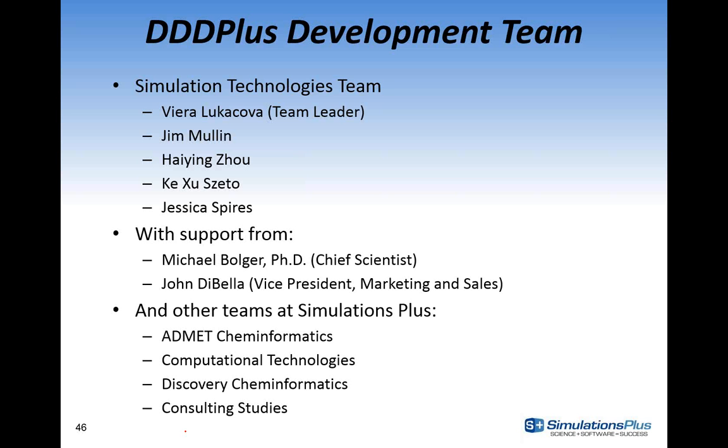Related to some additional feedback for potential new features and upcoming versions, are there plans to include CFDs associated with peak vessels into DDDPlus?